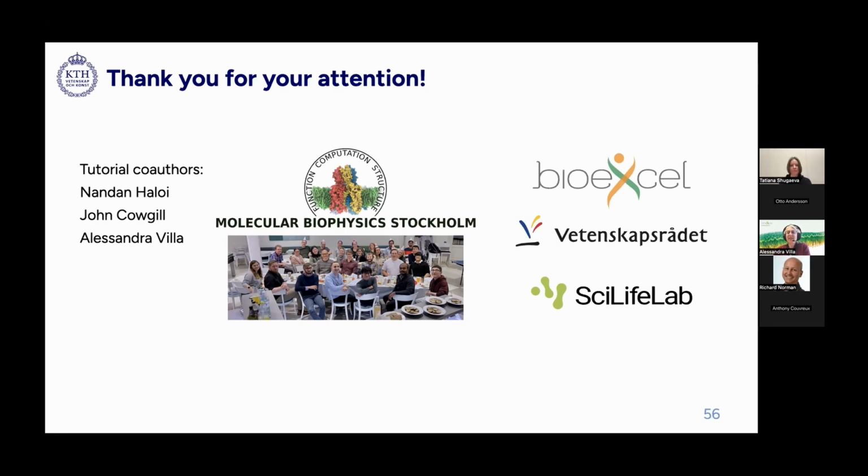And then we have a question about MD-based methods versus Rosetta, Monte Carlo based methods. He's asking if you ever compared an MD-based method with Rosetta's Monte Carlo based method for density fitting, in terms of performance and quality of the model. No, sorry, I haven't.